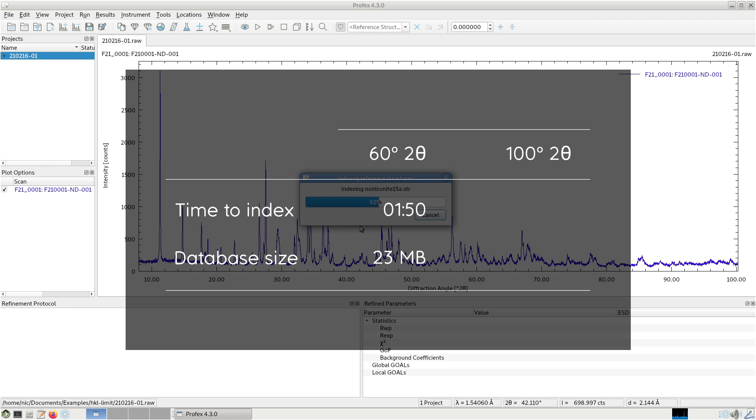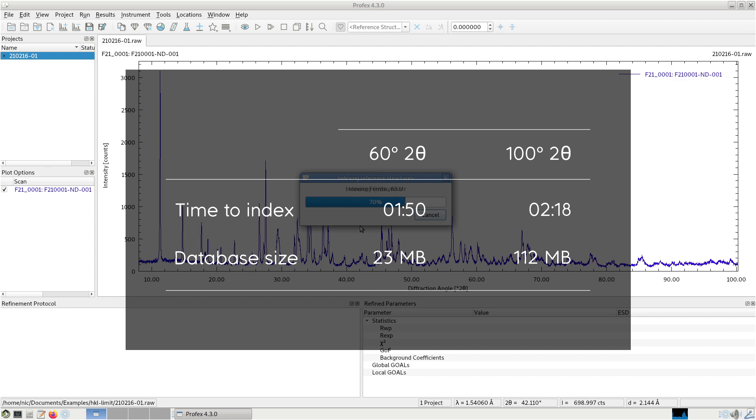And the buffer file storing this information was 23 megabytes. And if we set it to 100, it takes 2 minutes 18 seconds, so a little bit longer.